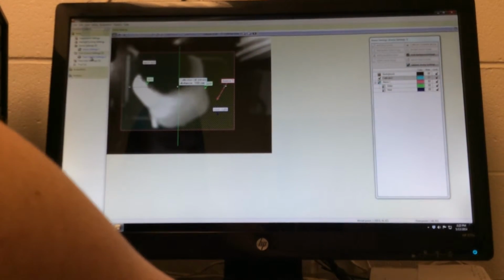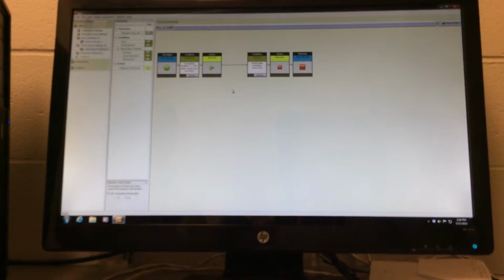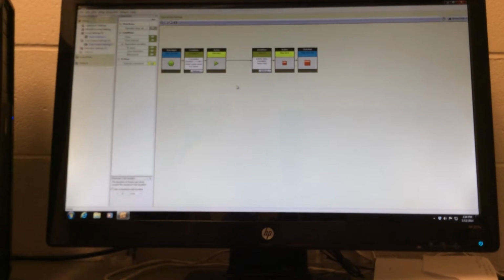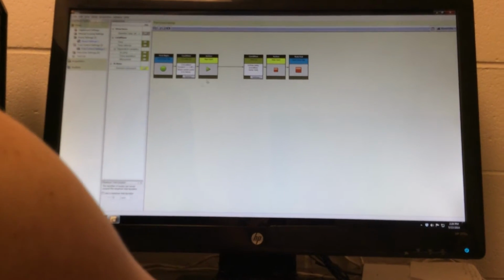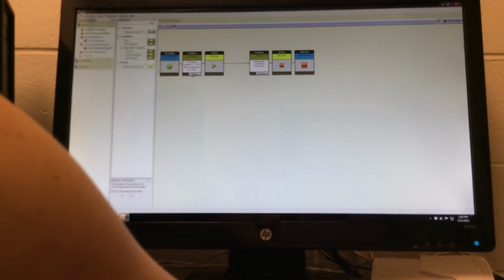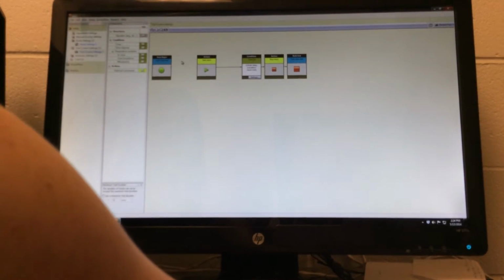Then I'm going to go to trial control settings. Here, you're telling the software, because we're automating it, when I hit this button, when is it supposed to start tracking and when is it supposed to stop tracking? So you don't have to do that yourself. Right now, we have this condition in place. So when you hit the green start button, there's a condition, and I'll delete this and show you how we pull it back up.